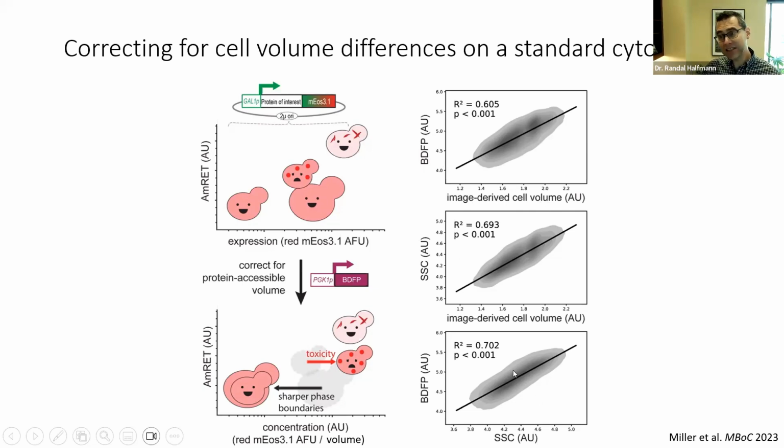So you can do this, and that's great, because now that frees you from constraints on the biological system. For example, if your cells have a wide variety of shapes, right? Maybe they're red blood cells, I don't know, right? They're not going to be spherical, so you can't easily calculate volume from them.